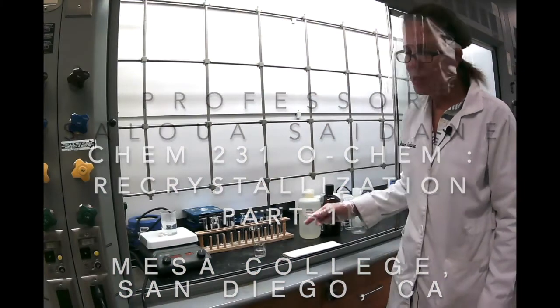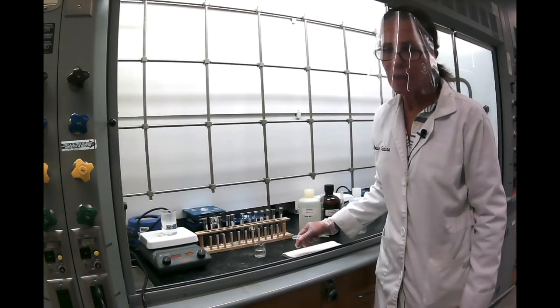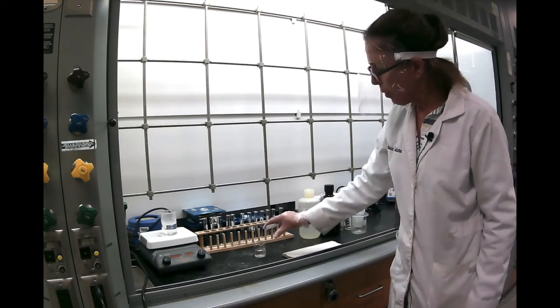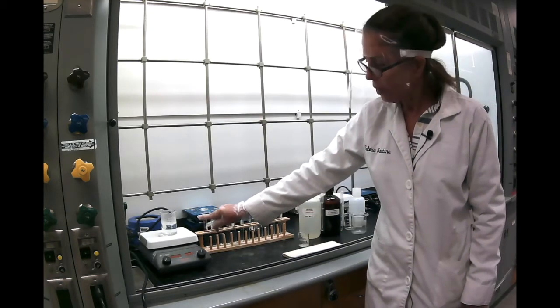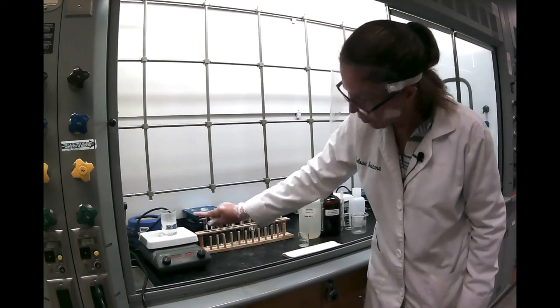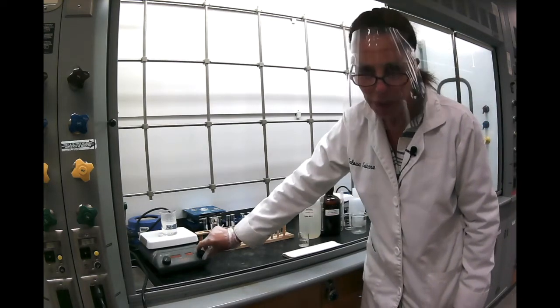So this is the first step of the recrystallization lab, which is choosing the right solvent for the substance. We started with some tap water heated, and it shouldn't be boiling really hard. It should be just like that. So keep controlling the temperature, don't overheat it.